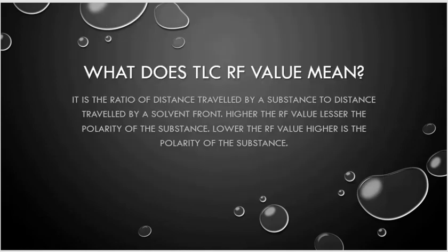What is the retardation factor, or the TLC RF value? It is the ratio of the distance traveled by a substance to the distance traveled by the solvent front. The higher the RF value, the lesser the polarity of the substance, and the lower the RF value, the higher the polarity of the substance. It shows the polarity and the affinity of the sample and the solute to the stationary and mobile phase.